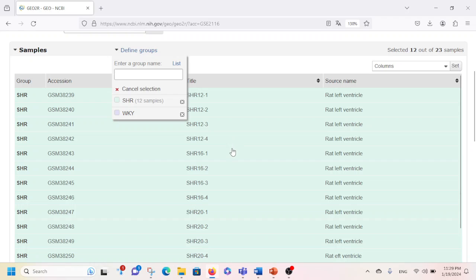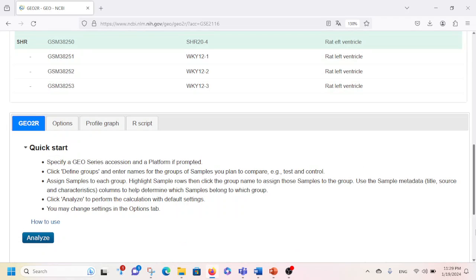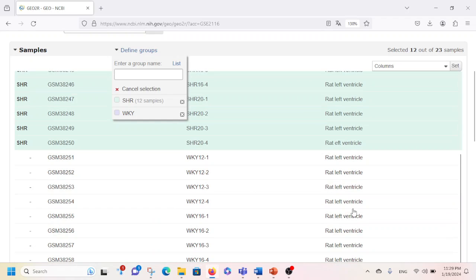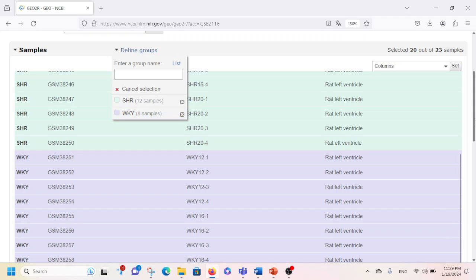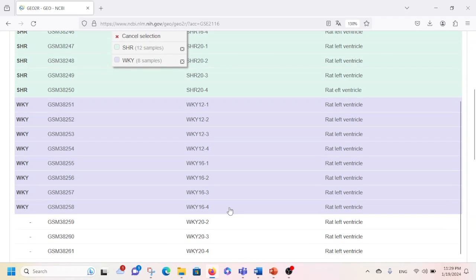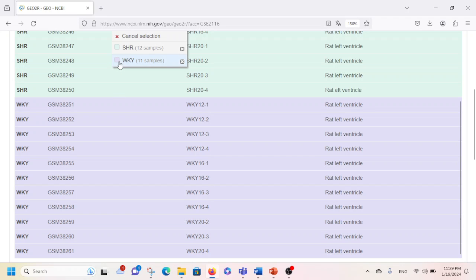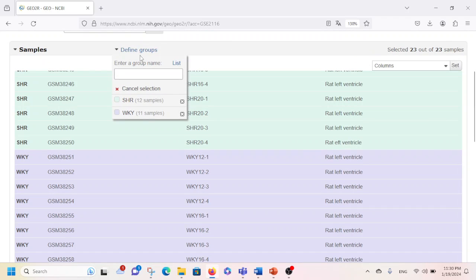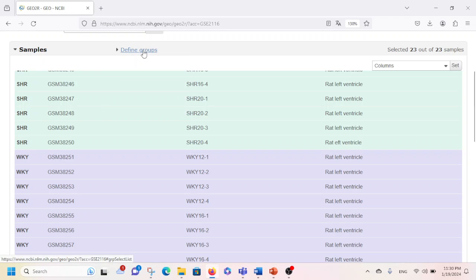Then I scroll down and I see the WKY samples, so I'm going to include all WKY samples into the WKY group. I check if there are any left — yes, I see three more samples left — so I'm going to select these also and then hit here. Now I have selected and defined the groups.